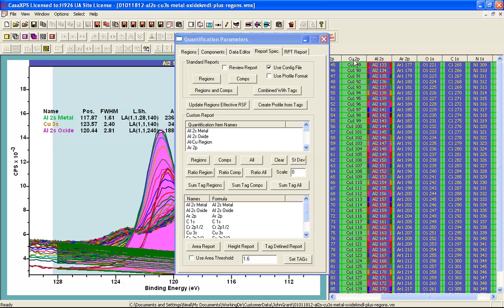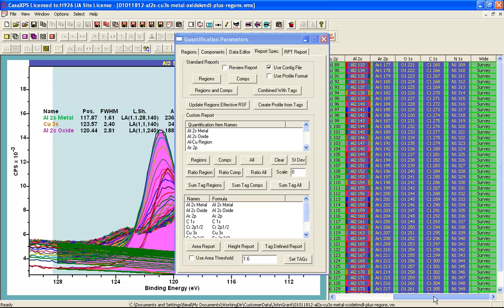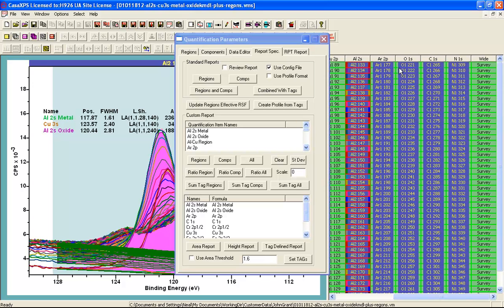Again the survey spectra there are multiple regions defined on the survey spectra but I am going to gather the information from these narrow scan spectra in order to construct the depth profile.